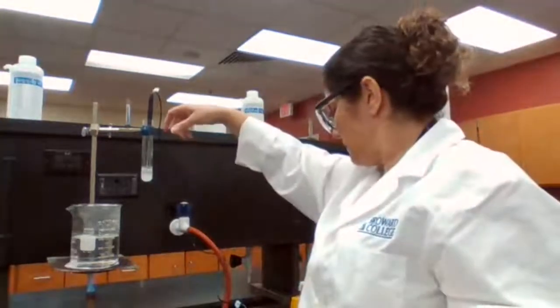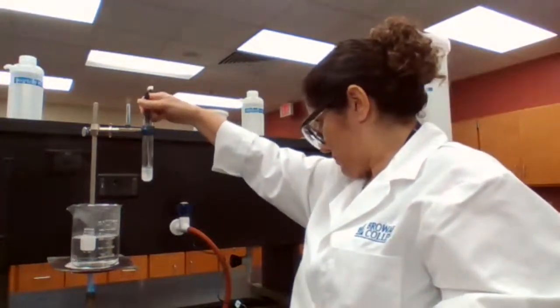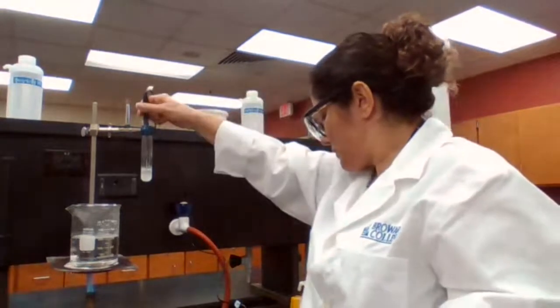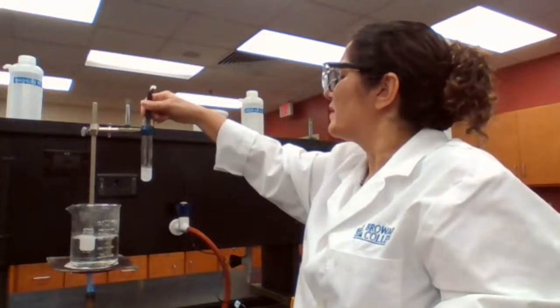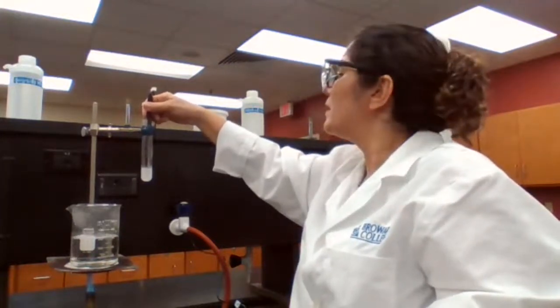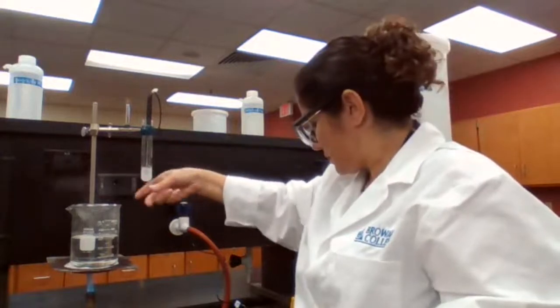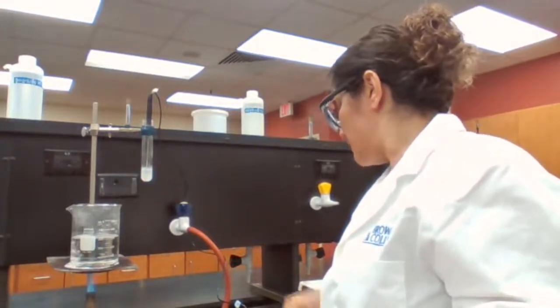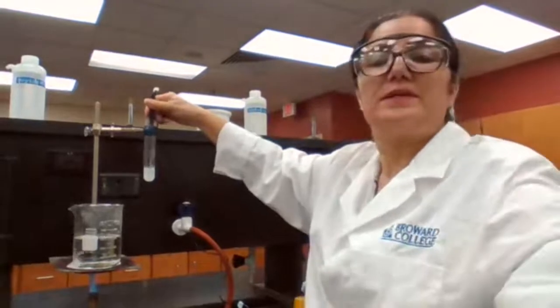It came back to 49. So you see that's changing to solid.